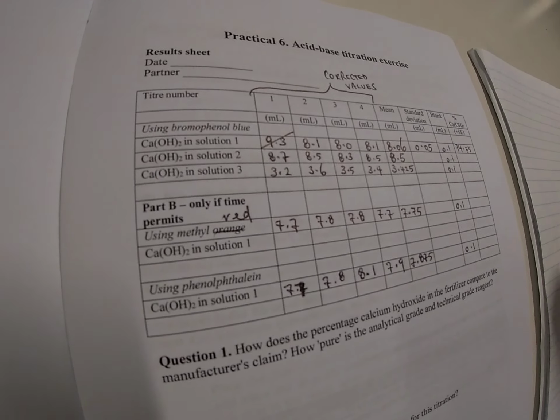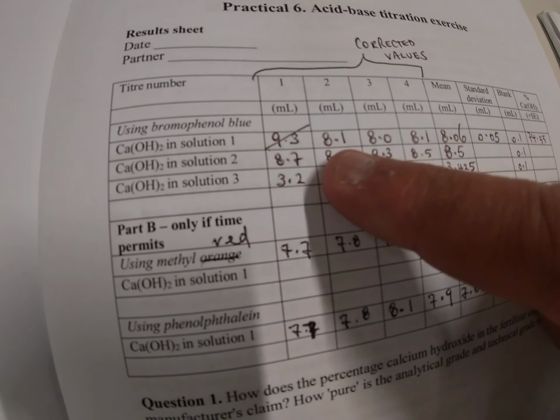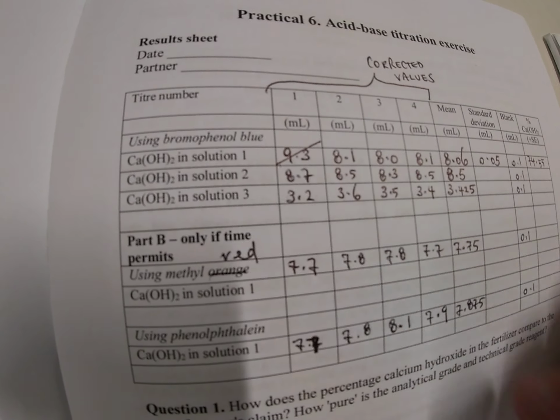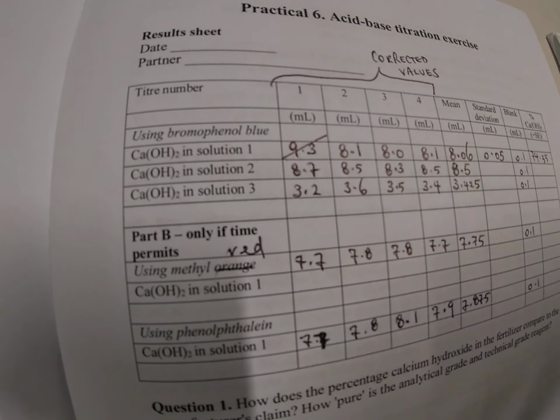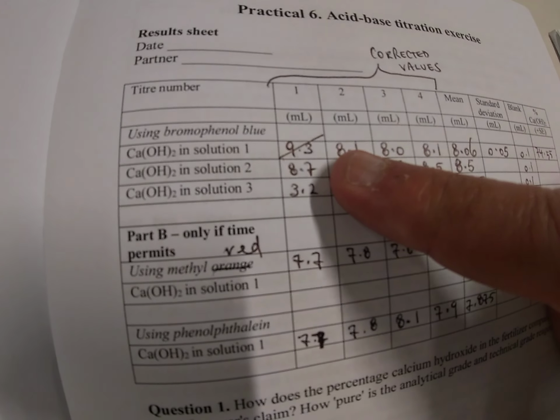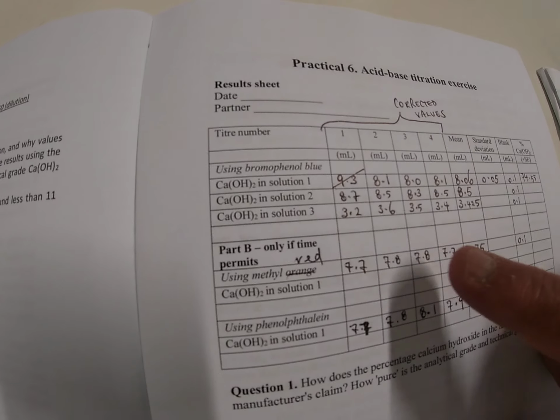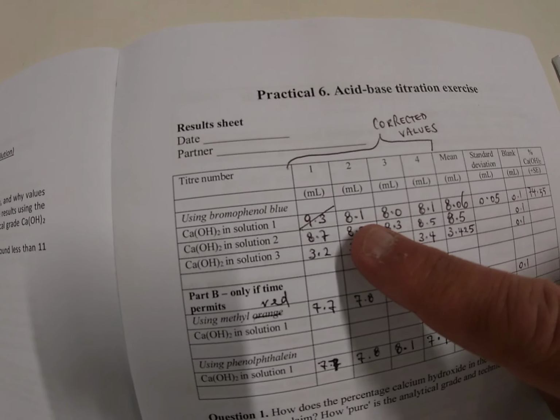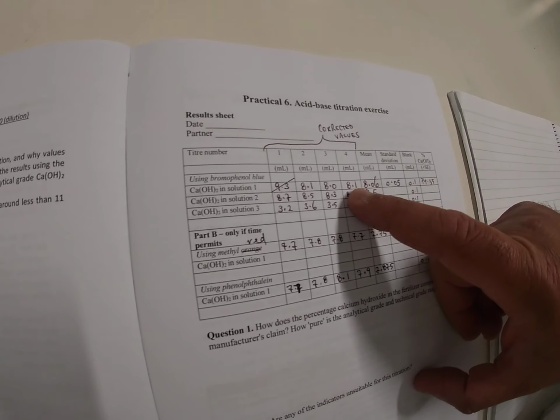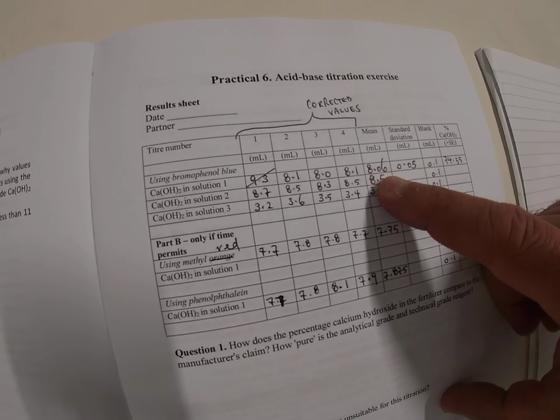What I've done here is included the corrected values. Now remember from our very first titer that we did, we actually got a high value. That's because we're still determining what our readings are going to be. So I've excluded that result because it would interfere with our final results. So I'm going to continue using the second, third and fourth titer numbers.